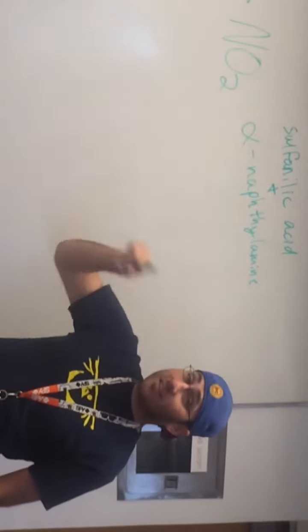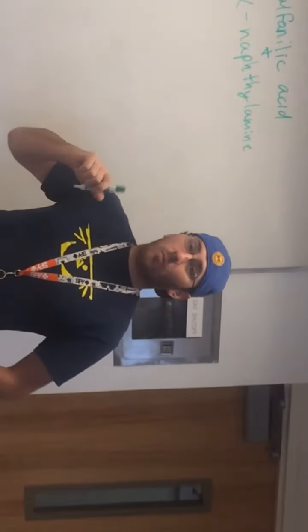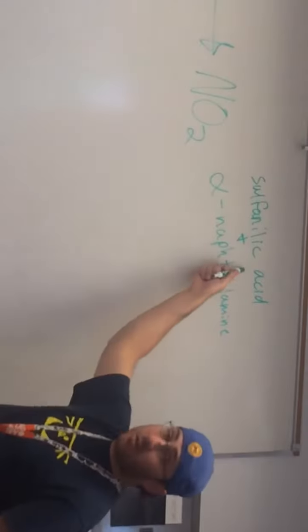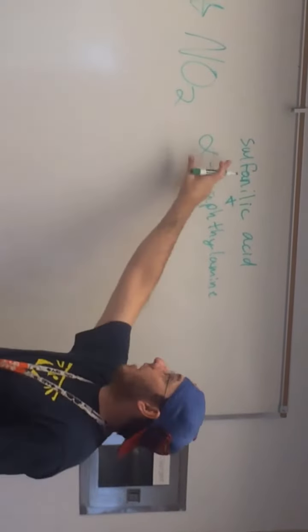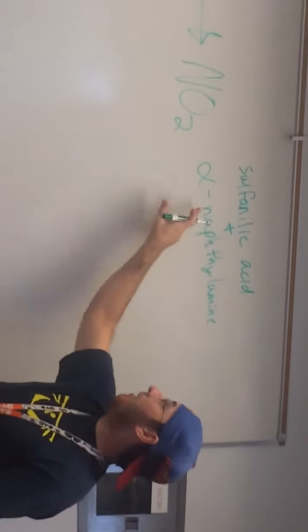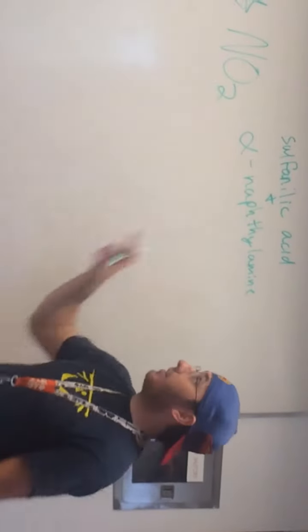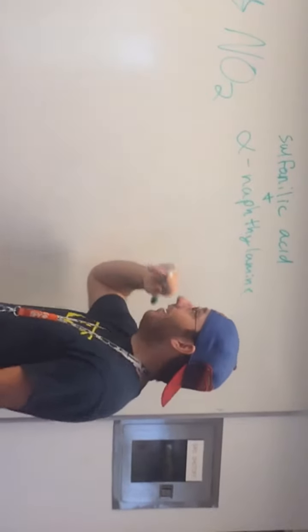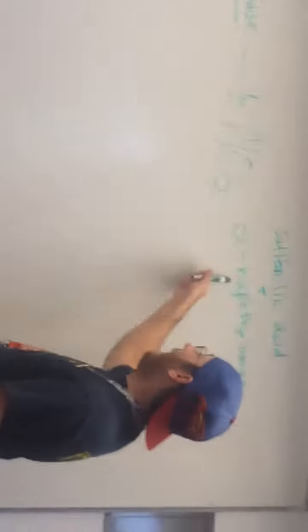I've actually seen this happen where I've had students who wanted to ask me a question and they wrote "ax." So practice makes perfect. If you accentuate the phonetic breakdown, sulfanilic acid, alpha naphthylamine, you won't spell it wrong. Practice it, because spelling counts on these. It's ridiculous.